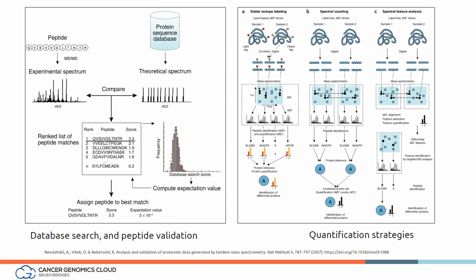The matched peptides are then validated. That step is called peptide validation. We have a tool called PeptideProphet that was inherited from the TPP set of tools that we incorporated into our pipeline. All validated peptides are then used for protein inference. For the protein inference, we also use another TPP tool that we incorporated called ProteinProphet, which gives us a set of proteins built based on all peptides with high quality. And then we apply the usual false discovery rate to the data set to allow only a percentage of high quality peptides, ions, and proteins to be considered.